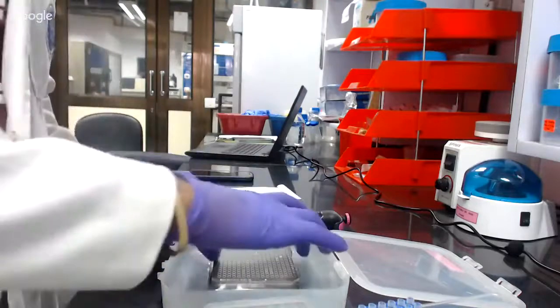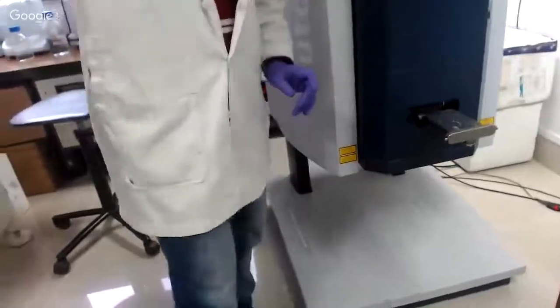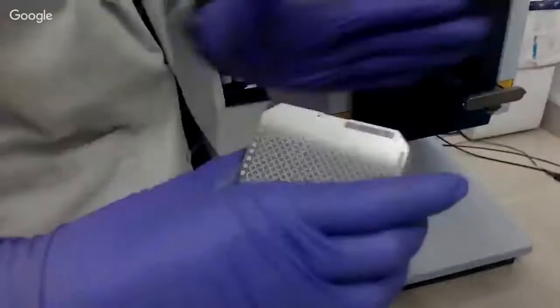So now I will also show how to put the plate in the MALDI. I put the plate here, and you can see there's a barcode also there. So this barcode should be on this side.